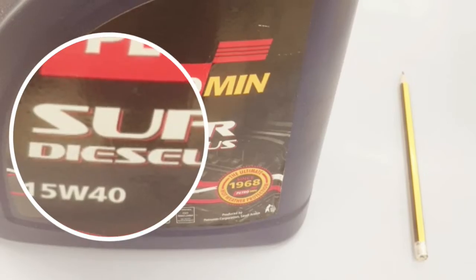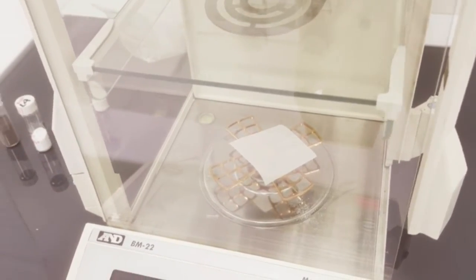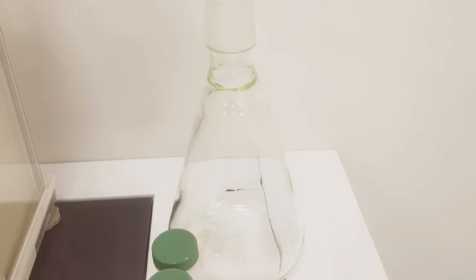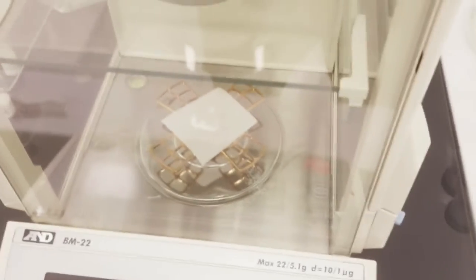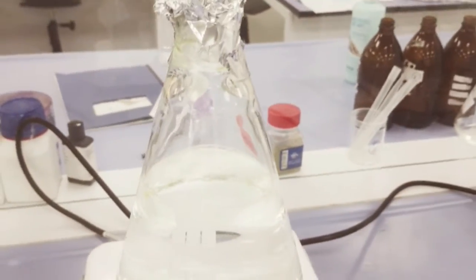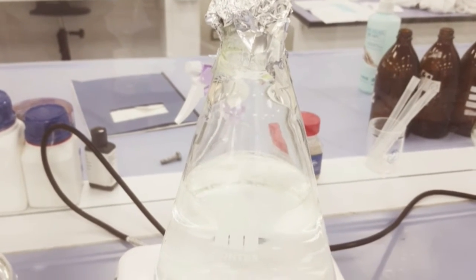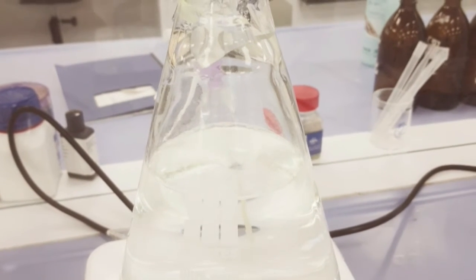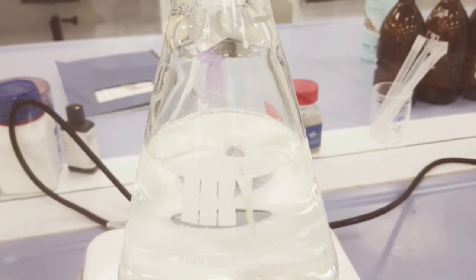The oil used here is diesel oil. As per the methodology, we will also add a surfactant so that the oil emulsion is well formed with the water, because as we all know, oil is not miscible with the water. Oil does not mix with the water, it will keep floating on the water. We have added around 20 milligrams of the surfactant. The surfactant is sodium lauryl sulfate. Now you can see that after adding the oil and surfactant in water, it has slowly started to mix. Usually it takes overnight to form an emulsion.